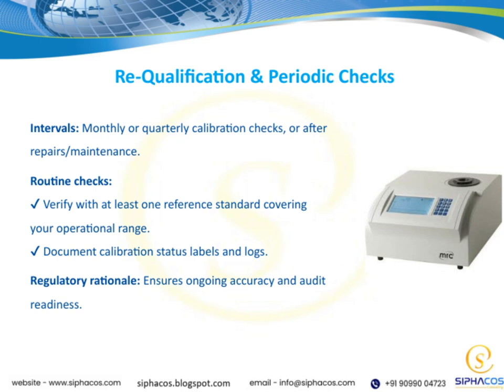From a regulatory perspective, these practices are vital because they ensure ongoing accuracy and help us stay audit-ready. Keeping up with regular requalification not only safeguards the quality of our measurements, but also supports compliance with industry standards. So, in essence, these checks are about maintaining confidence in our equipment and, ultimately, in the integrity of our results.